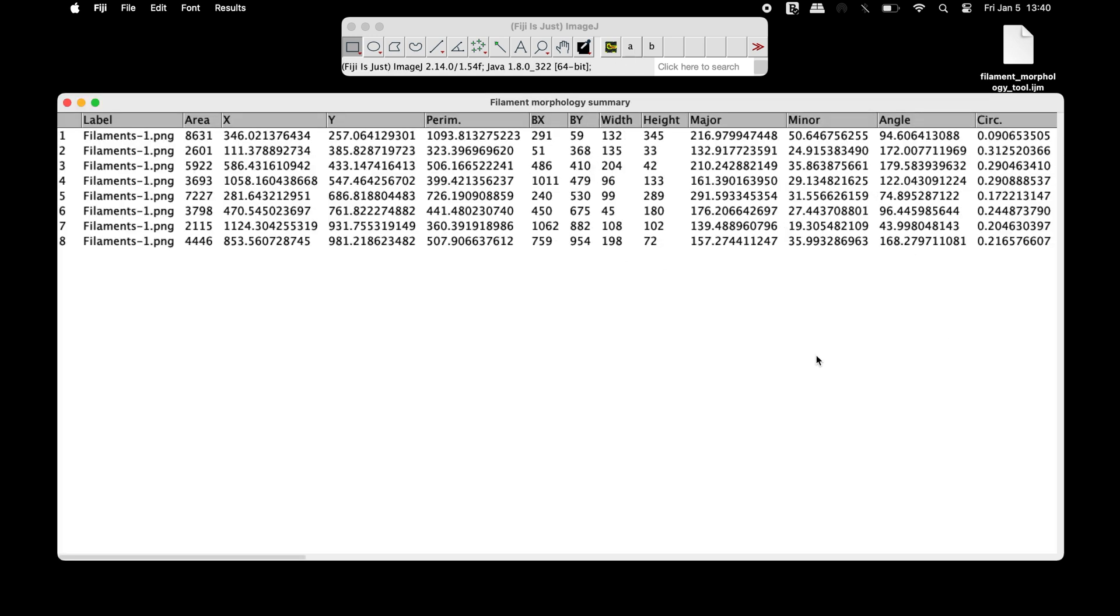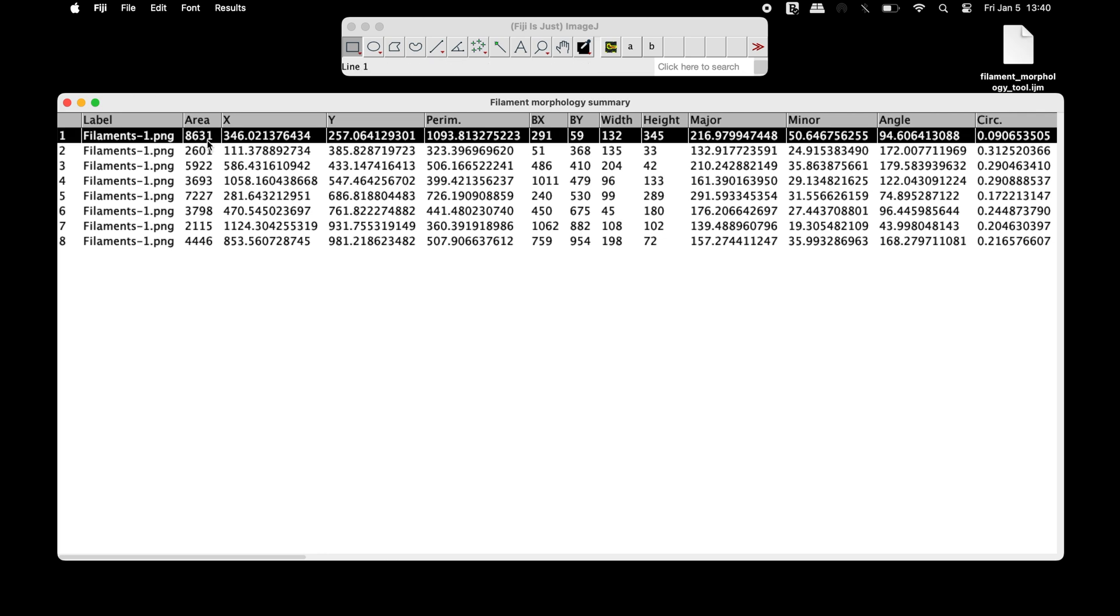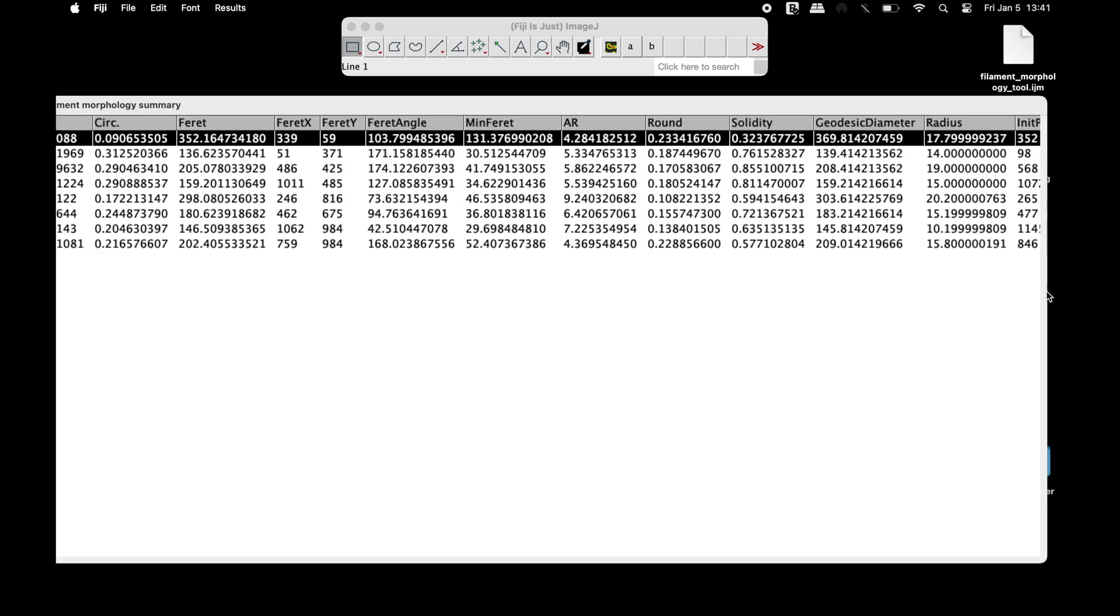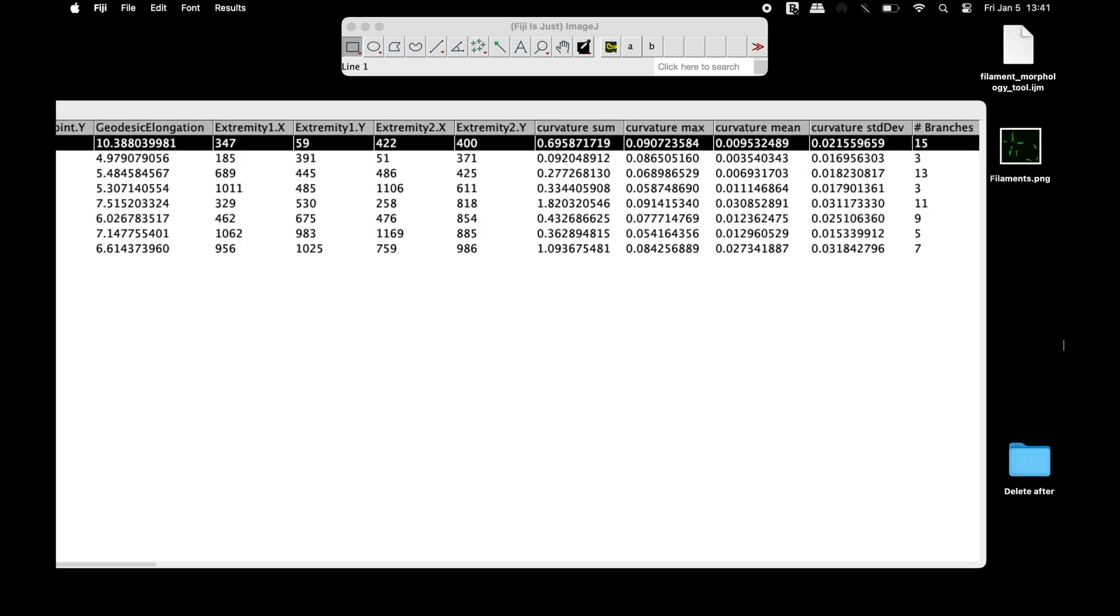In the FilamentMorphologySummary window, information can be obtained for the filament area, X and Y points, perimeter, width, height, angle, circularity, curvature, number of branches, and other information.